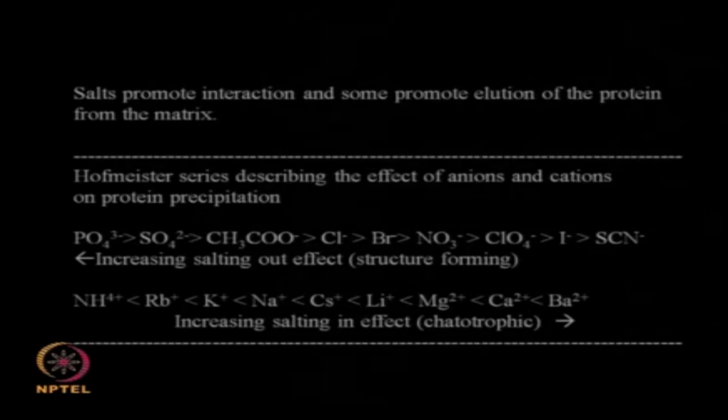So you can play around with the type of anions or with the type of cations, either to enhance the interaction between the protein and the ligand which is immobilized through hydrophobic interactions, or I can reduce the interaction between the protein and the ligand.